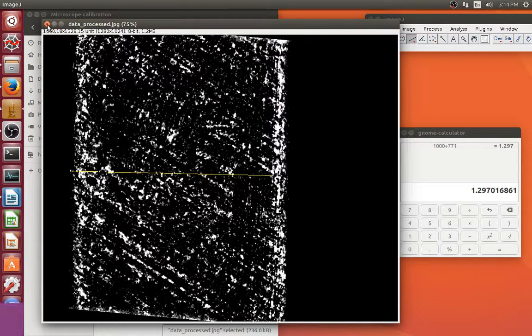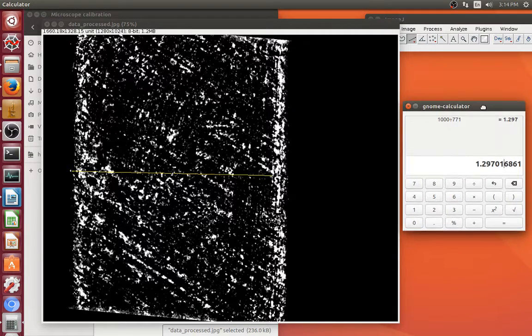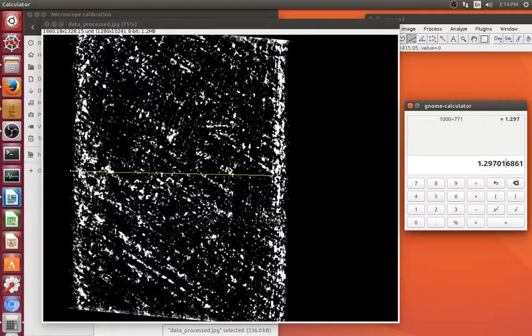So what is next? Now the problem is that the calculation we did is only done for a magnification of 5. That means if this picture had been taken in a different magnification, this length that we've calculated would have been a different number. That means you have to multiply or divide this by the factor that correlates the two magnifications with each other. Added to that problem is that these pictures can be taken at different resolutions of your camera sensor.